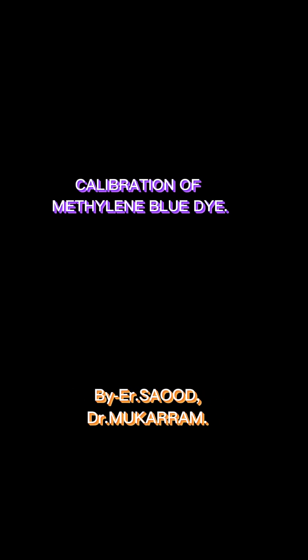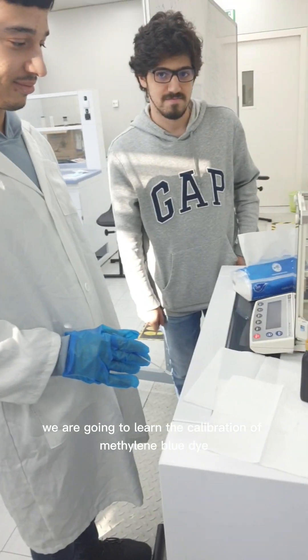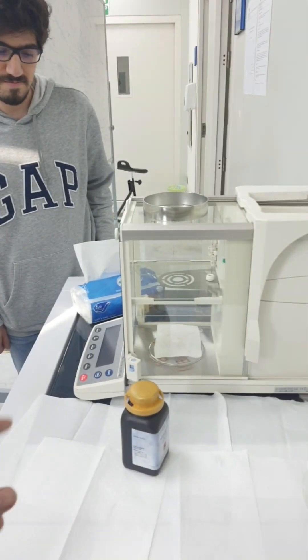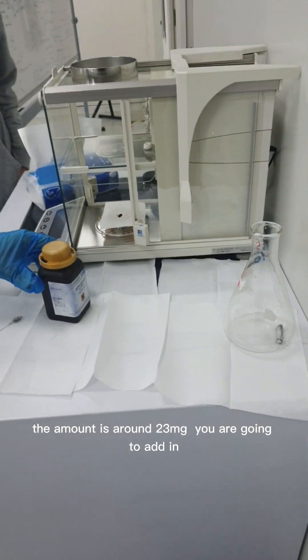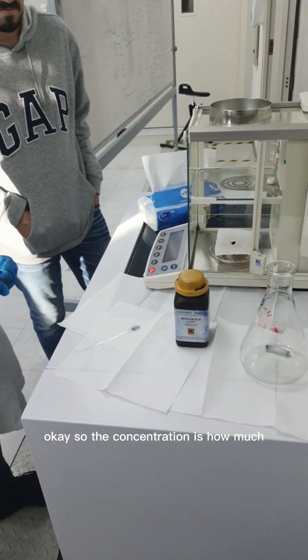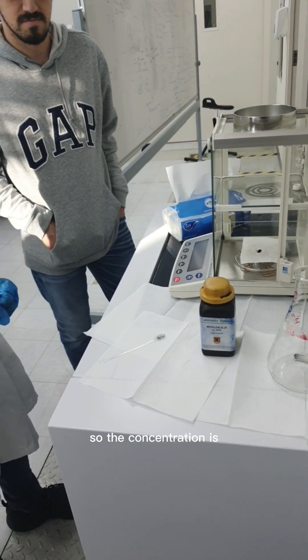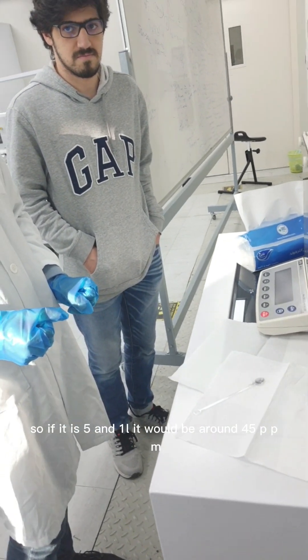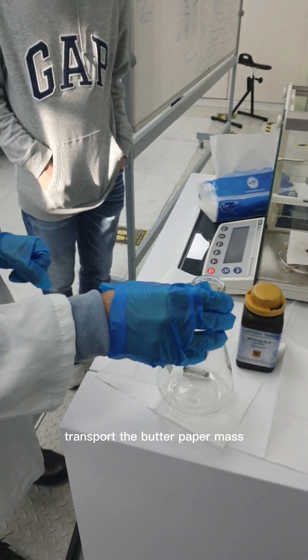Today we are going to learn the calibration of methylene blue dye. First of all, we have to weigh the required amount of dye — around 23 milligrams — which we are going to add into 500 mL of water. The concentration works out to approximately 45 ppm. Please transfer the dye from the butter paper.